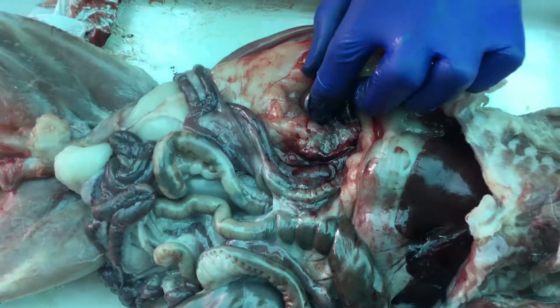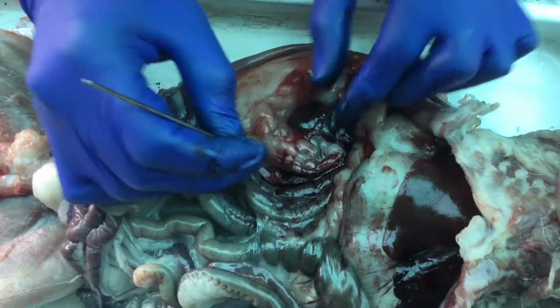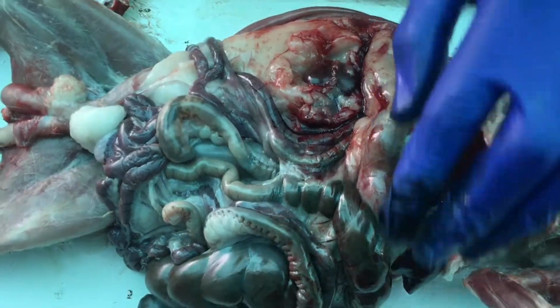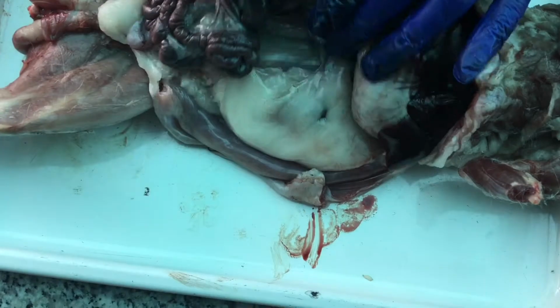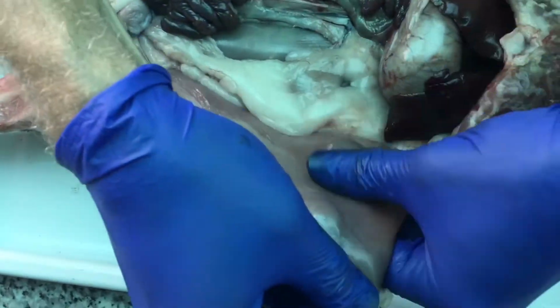Its blood vessels would be coming off here, connecting back to the midline. And if I go to the other side of the body, I should be able to see the kidney on the left side as well. Again, here's my left body wall.